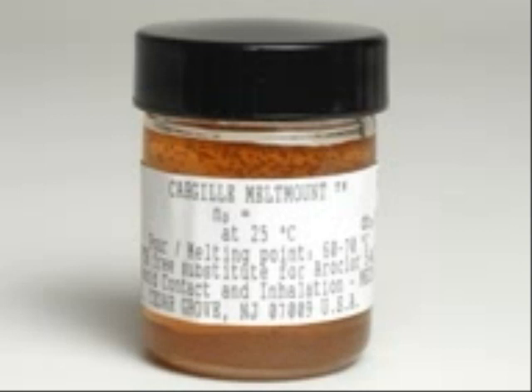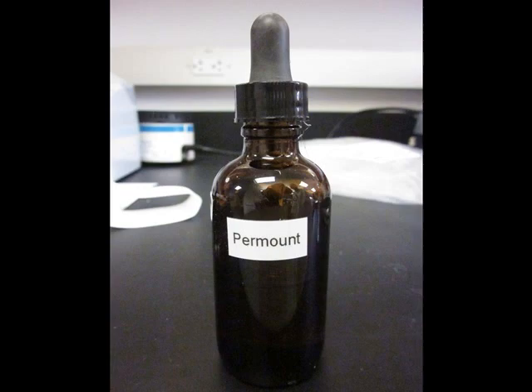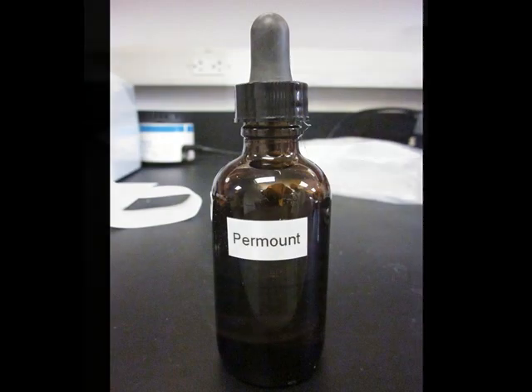Semi-permanent mount is another type that involves Cargille melt mount, which is a waxy solid at room temperature. It can then liquefy under modest heat from a water bath or hot plate and will become solid again upon removal almost instantaneously. Other common mediums used are Permount, which is a resin dissolved in toluene.